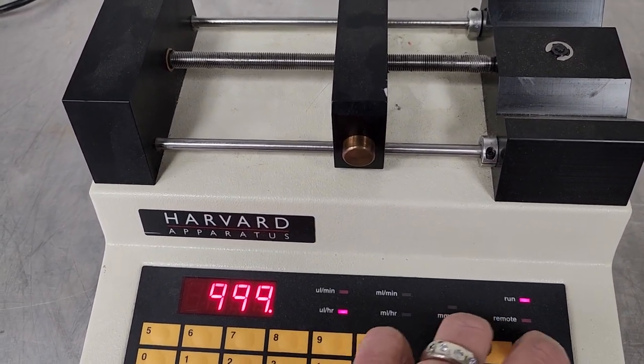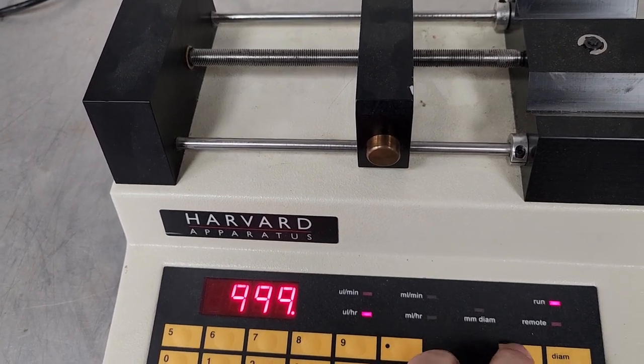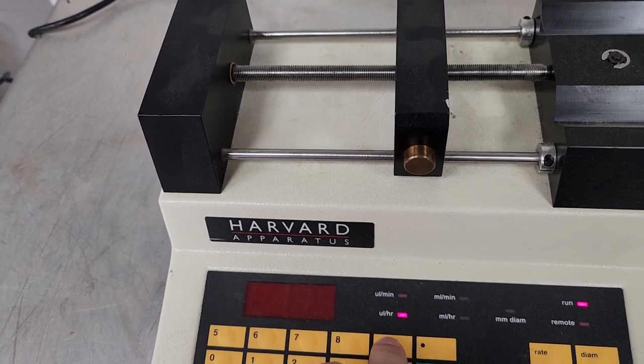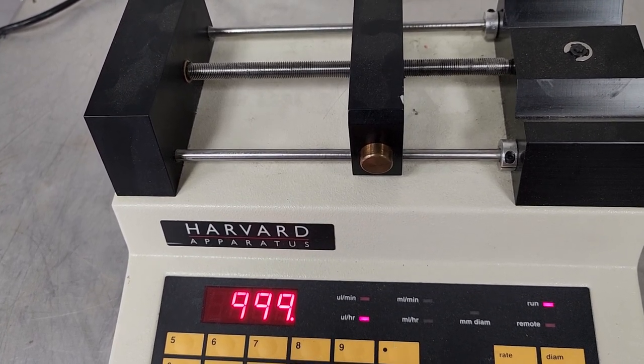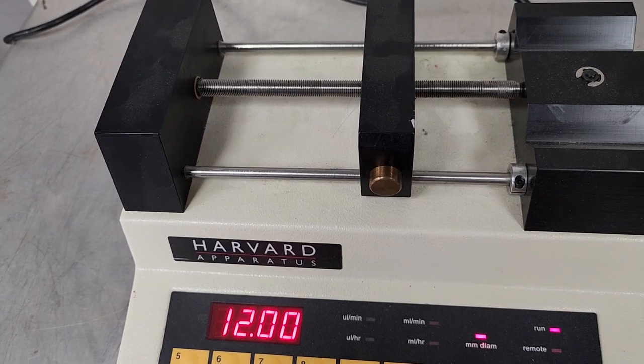But you can also set the diameter. I wonder why it was faster before. So let's try this again. Rate 999. Maybe the diameter's too small.